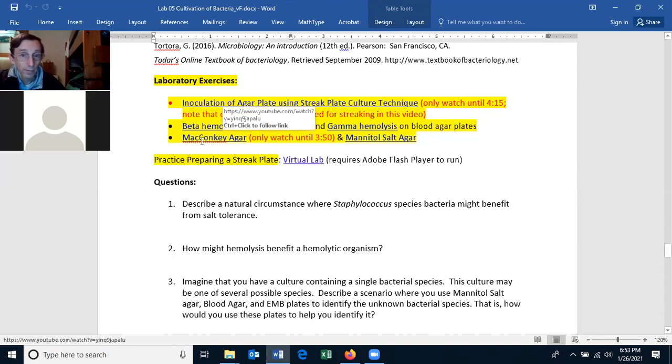You'll also watch a video on beta hemolysis, alpha hemolysis, and gamma hemolysis, and this is done on a blood agar plate looking for hemolytic activity. And then you'll watch a video on MacConkey agar. You only need to watch it until 3 minutes and 50 seconds, and then you can stop the movie. And then there's a little video on mannitol salt agar.